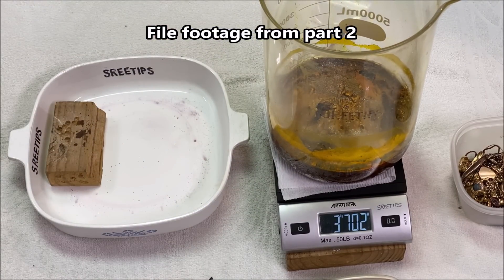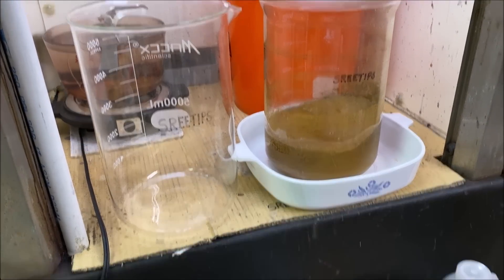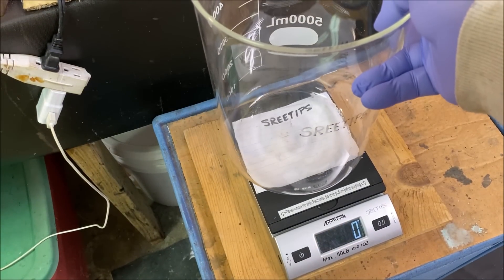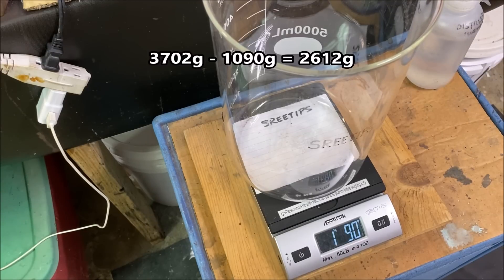We've got 3702 grams of mass right there, so we'll record that and use it later on in the video. Here's the weight of the empty beaker from part one where we weighed the chloroauric acid crystals — the empty beaker weighs 1090 grams.